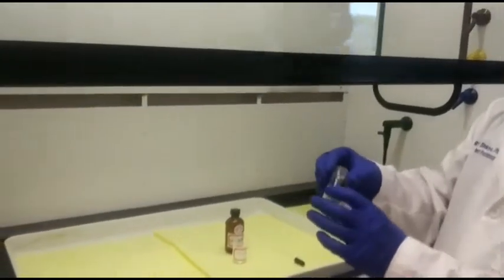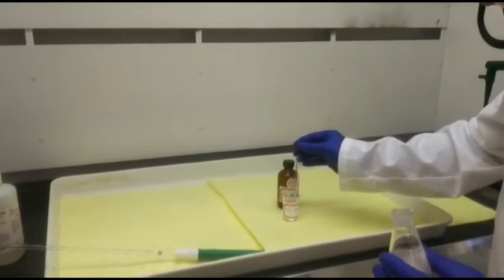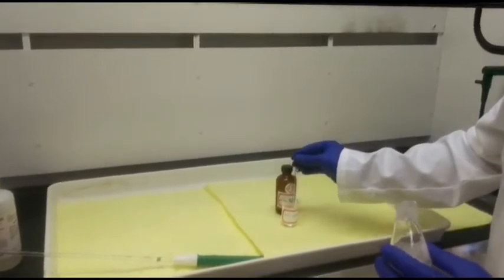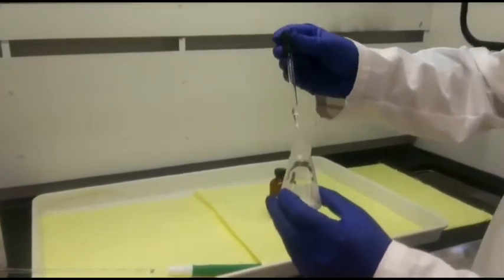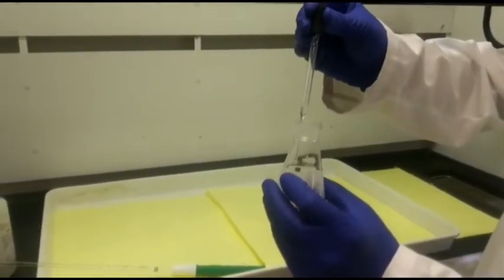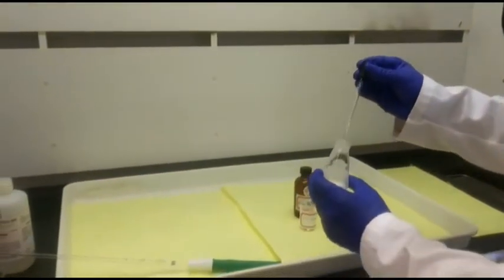Now, the reaction takes place in acidic condition, so I need to add 5 drops of phosphoric acid. So I will add 5 drops of phosphoric acid here. 1, 2, 3, 4, 5. Okay, 5 drops of phosphoric acid.